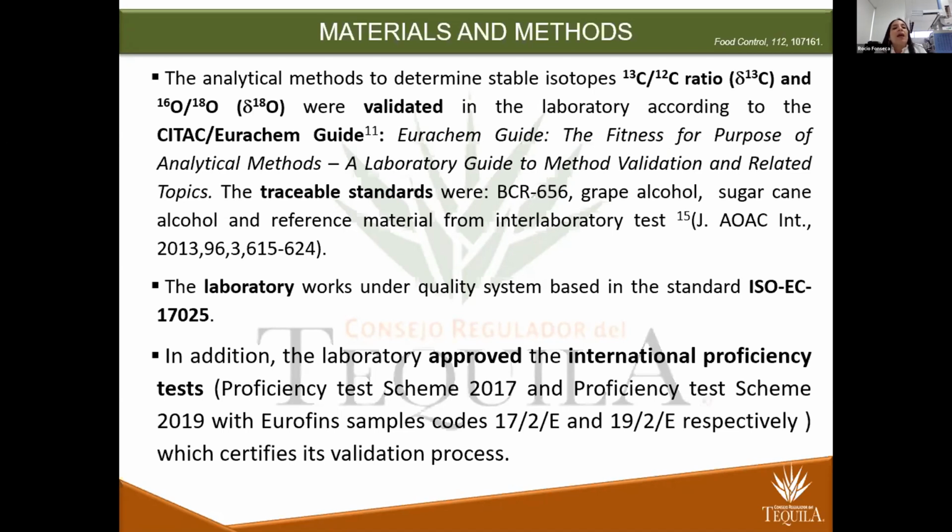Right now, the laboratory works with a quality system based on the standard ISO IEC 17025. In addition, the laboratory passed the International Proficiency Test in 2017 and 2019. Now, I want to present the results of our study.